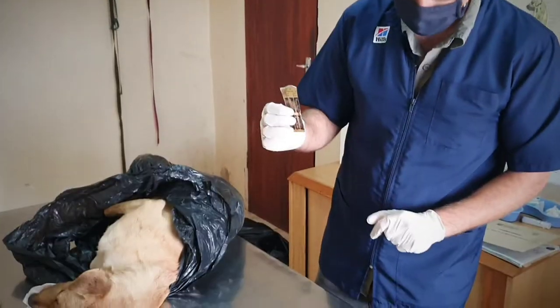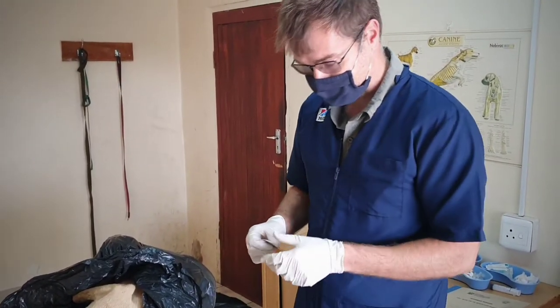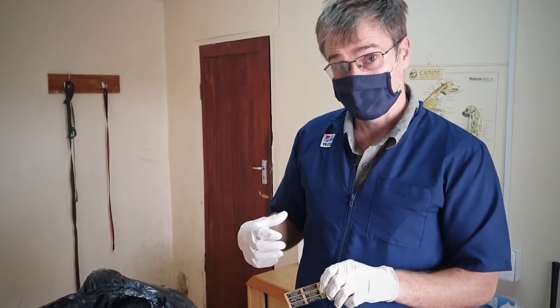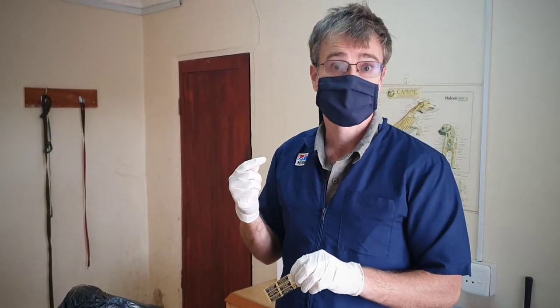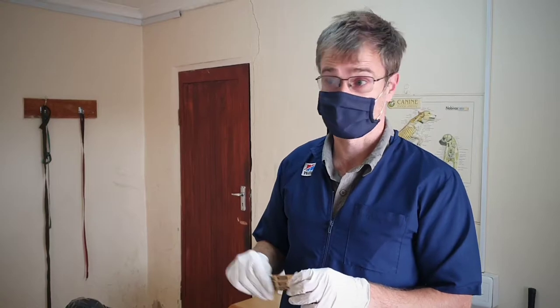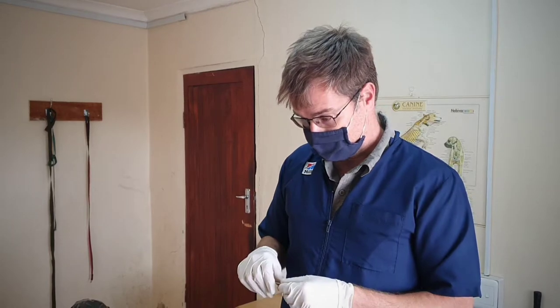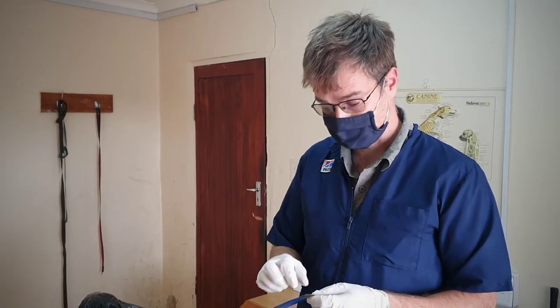Then what else you'll need is a scalpel blade, scalpel handle ideally, just so you don't end up nicking yourself. There can be a few droplets or aerosols so you do need a face mask and ideally glasses. A face shield would be ideal. Then I'm also wearing a lab coat. You should wear overalls or something like that that you can take off and disinfect after taking the sample.